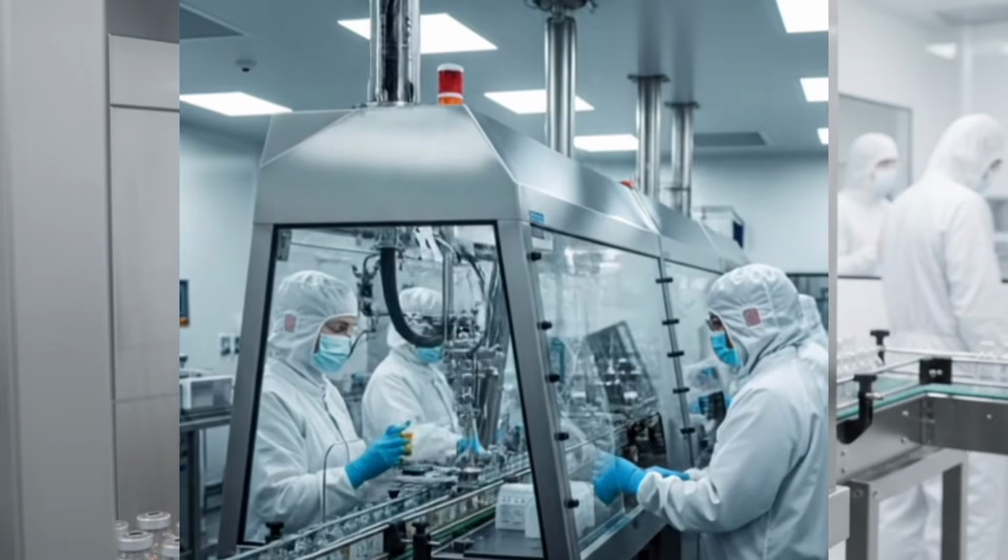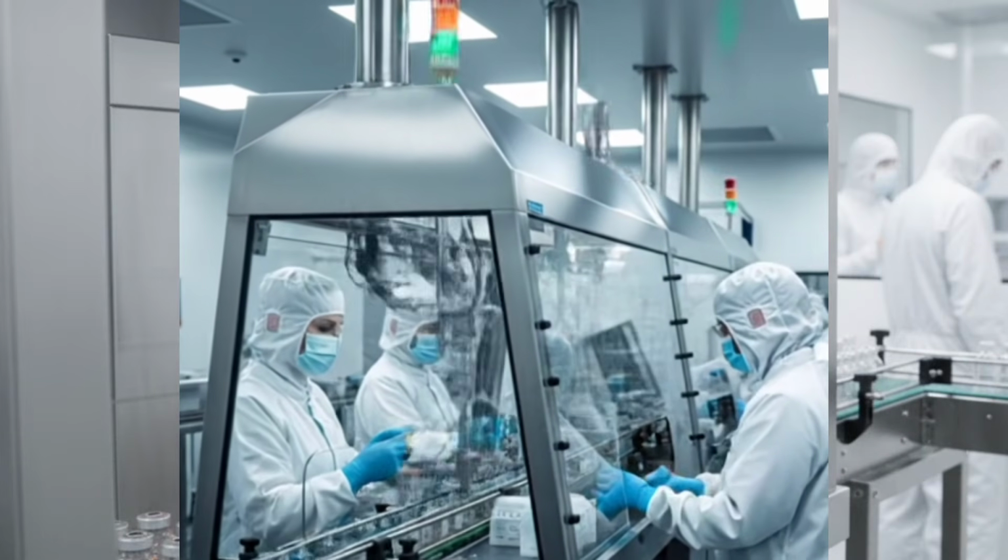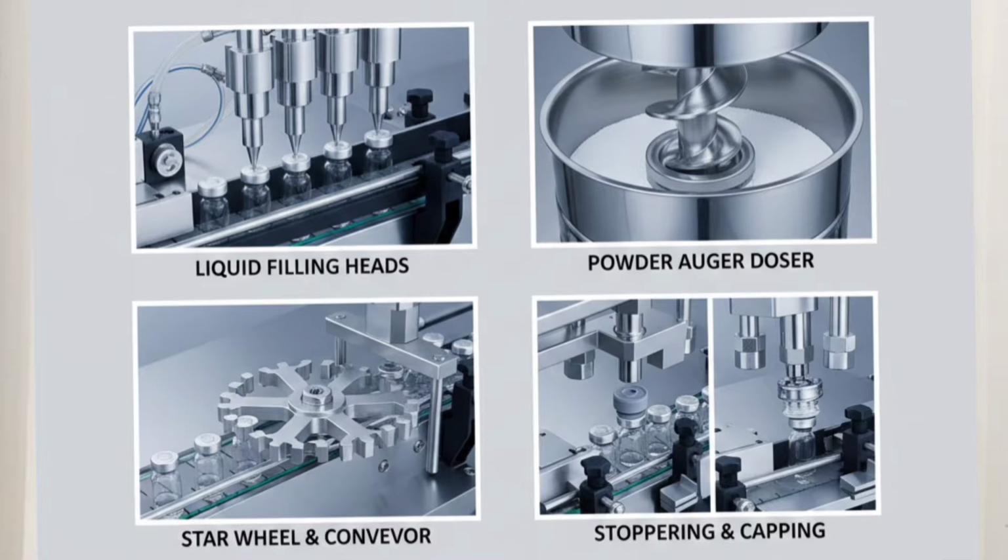This method helps to monitor the contamination on tools involved in the drug manufacturing process, such as filling syringes, needles, SS tables, shelves and other equipment.